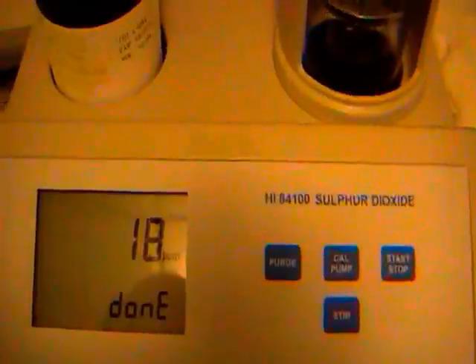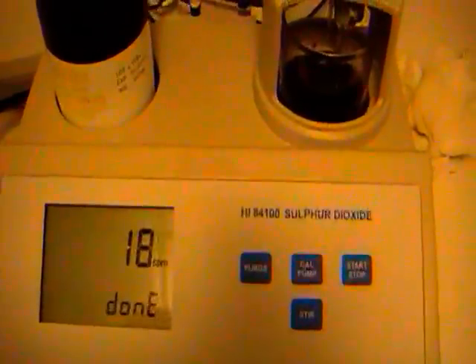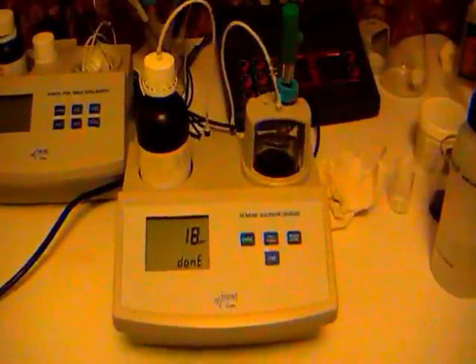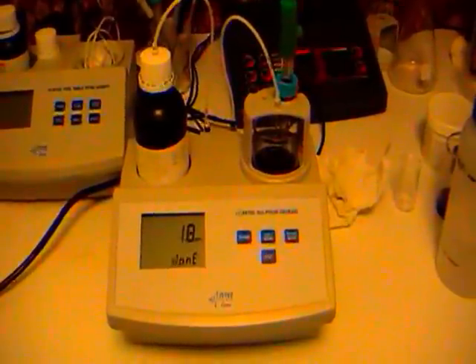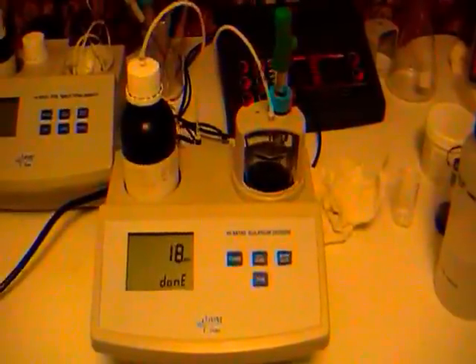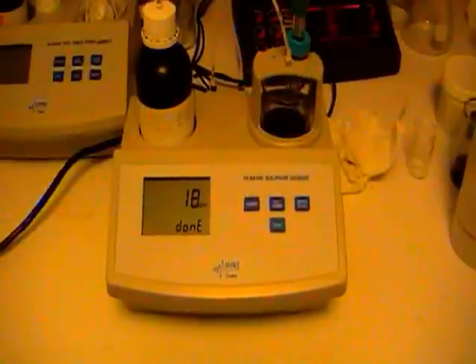We've got 18 parts per million in this sample, so not quite what I was hoping to get. But I was very conservative with what I put in because I didn't want to go over — so that means I'll be adding some more. If it wasn't because I have to hold the camera with one hand, this test would have been done a long, long time ago. It looks like I'm going to have to put another 18 parts or so in there, then run my tests again in another 24 hours. It's a nice machine if you can afford it — because you're not guessing what to do with the SO2 measurements.